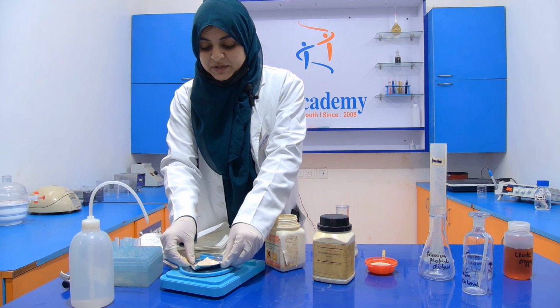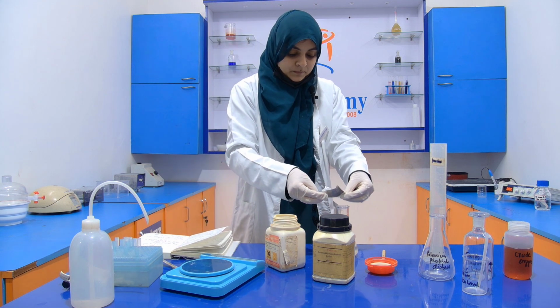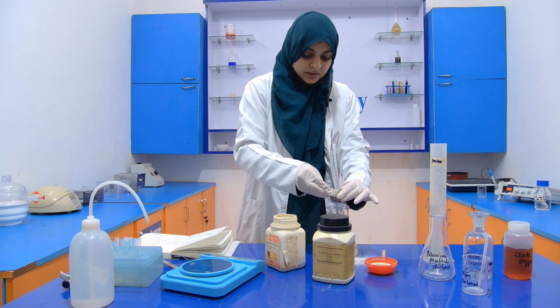Now at last we take 12 gram. Then it will become 32 point.